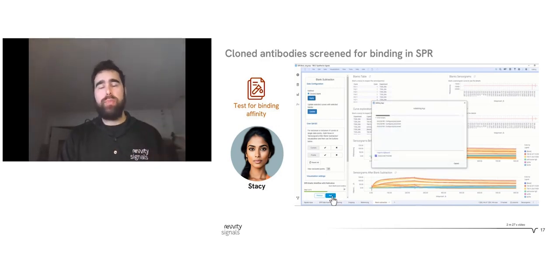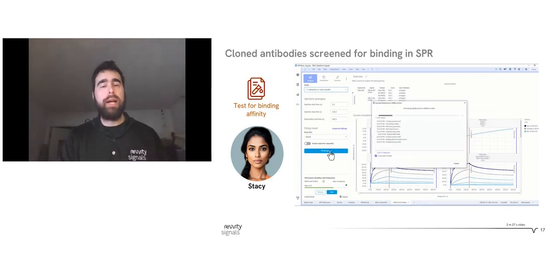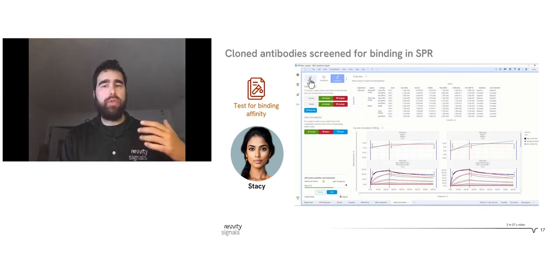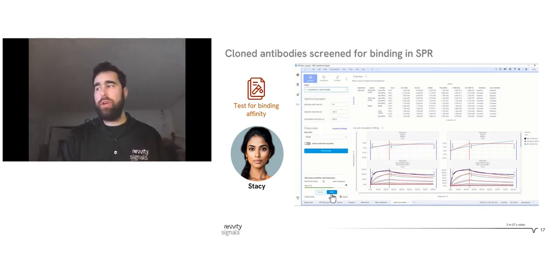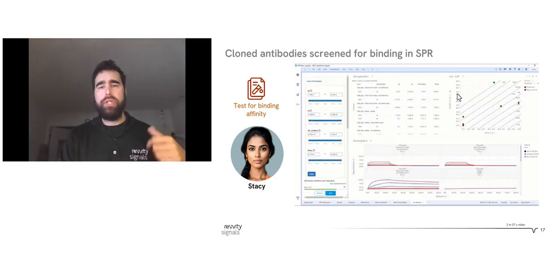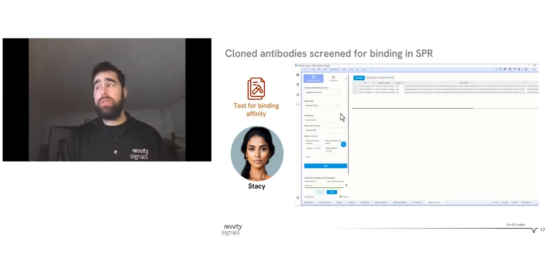So finally, the data is put into a kinetic modeling, one-to-one mass transfer calculation, and we'll be doing a curve fit to be able to model the data and extract the right parameters. So modifying the way the curve interpretation is being done, and finally getting the kinetic curve here, we're able to look at the Ka and Kds, each of which is useful for the team. And at this point, we can do a QA/QC for knocking out various different points that are outside the bounds of interest. And then, of course, she can publish this data.